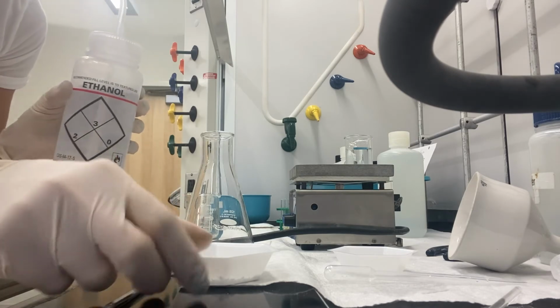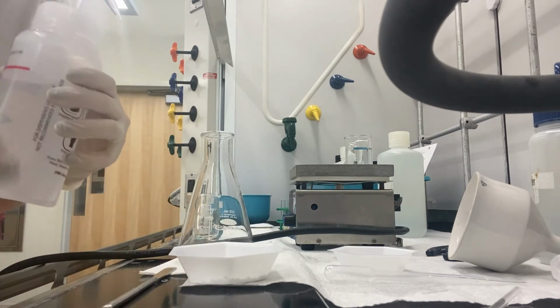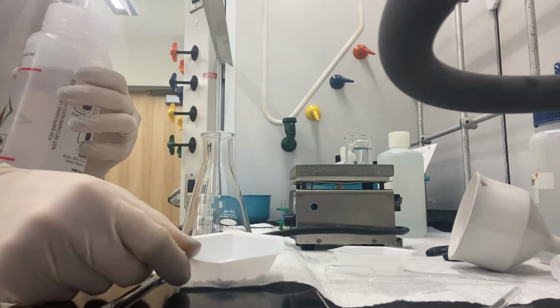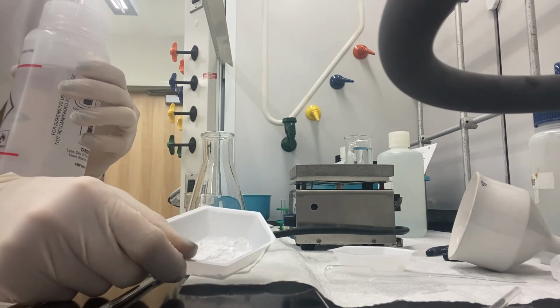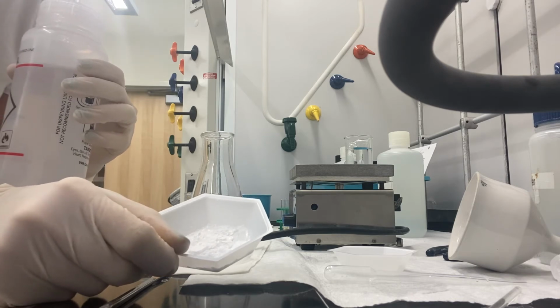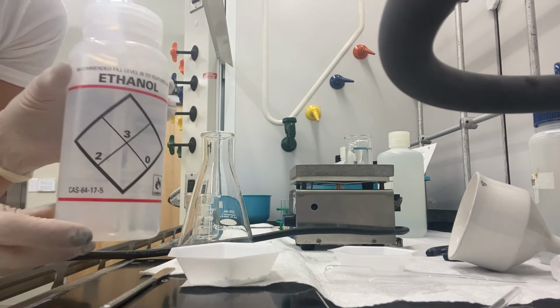So now we need to recrystallize our white powder, our technically separated aspirin, but we want to purify it. So we're going to do that by recrystallization. Remember, that's one of our organic 1 techniques, and we'll hopefully have some nice pretty white crystalline solid after this. So we're going to do this from ethanol.